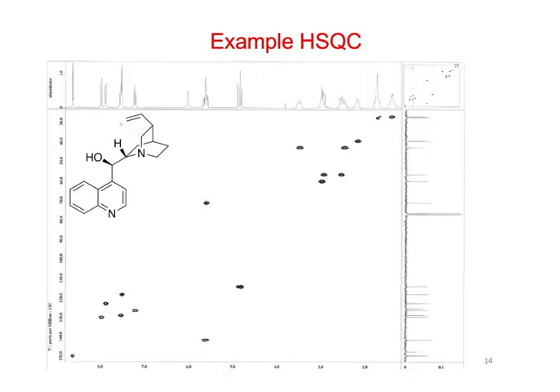All right, so here's just another set of examples that I ran for fun. This is an edited one. We can pick out a few things here, like this most downfield one is going to be this one next to the nitrogen. It's a little hard to see here, but this one has a small coupling constant.